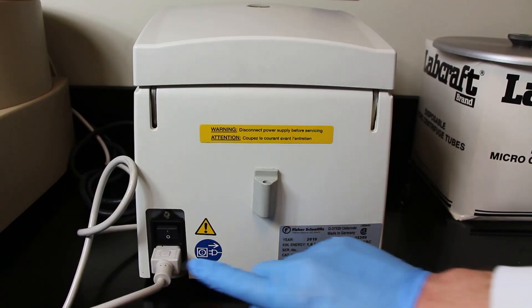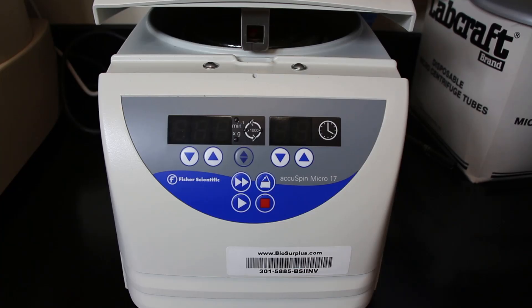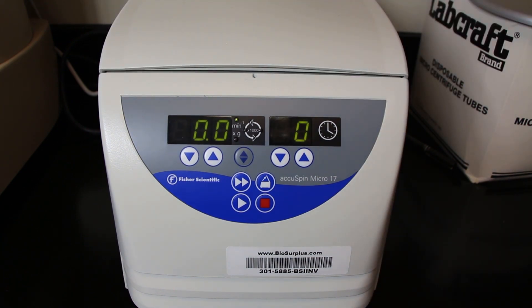First thing you want to do is turn on the device. There's a little on-off switch on the back left-hand side of the centrifuge. Flip that to the on position and you'll see that the screen on the front of the machine lights up and there will be some numbers and letters that will display.